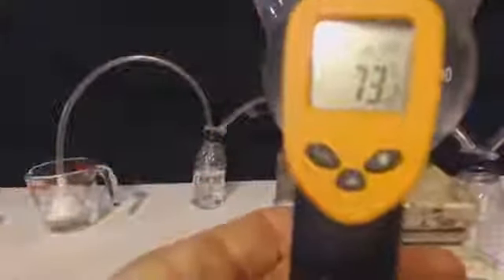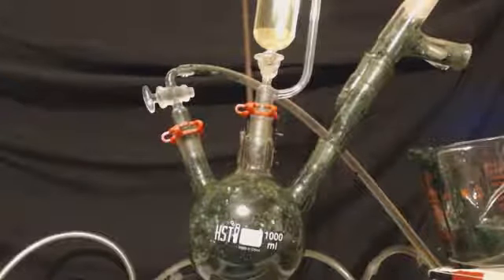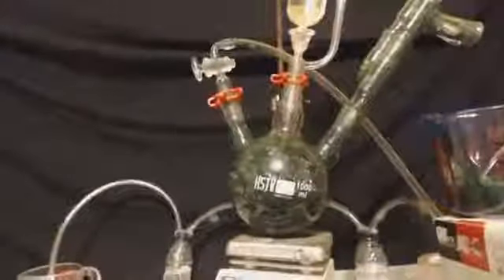Now this happens. It produces heat as it goes. I'm not heating that at all, and you can see it's already 73 degrees Celsius. And look at what happened. I went too fast. I wish I would have had this tape, but in a way, I'm glad I didn't, because I would have run over my camera trying to grab up pieces to direct that foam somewhere. If I would have had a piece handy, it would have been no big deal.